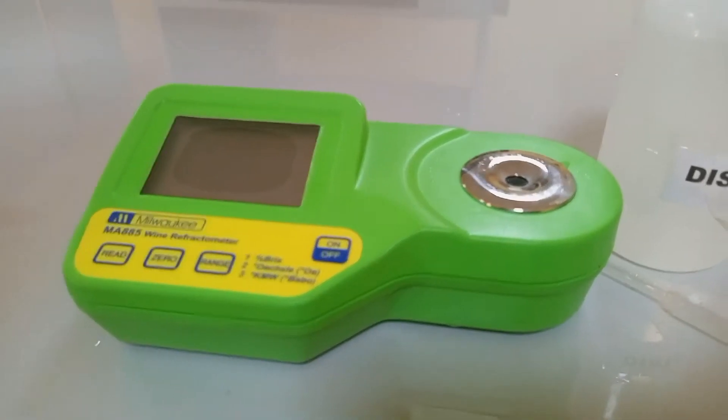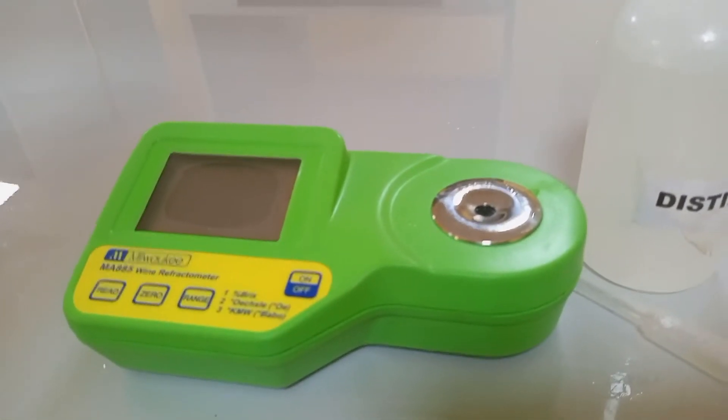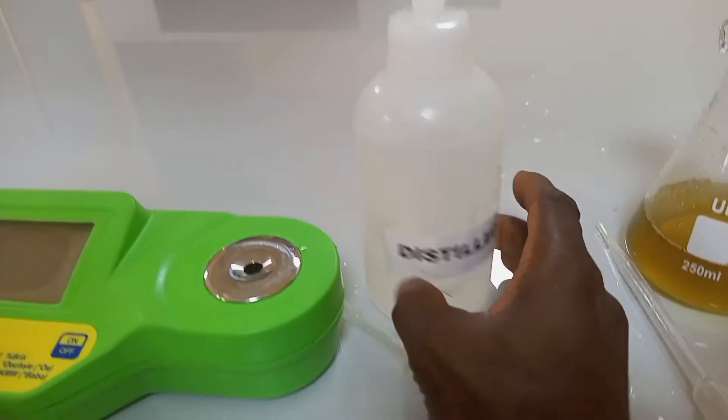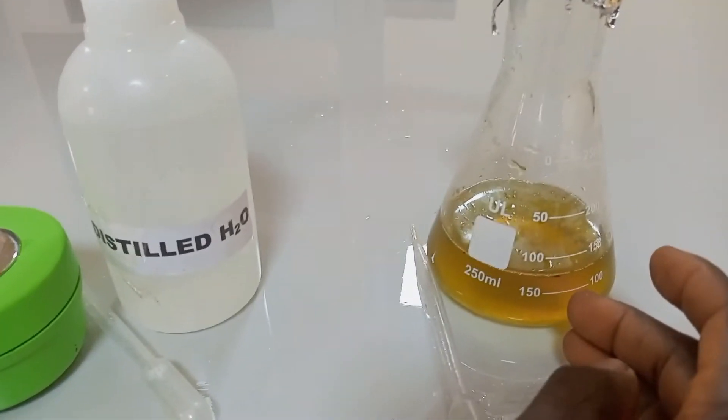How to use an optical refractometer? This is the MA885. This is the instrument, distilled water, and the sample to be analyzed.